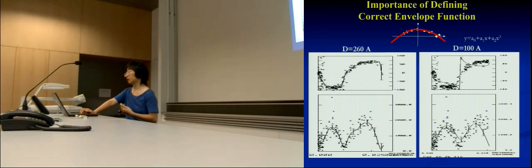So it's a way of finding out if you don't know your protein well enough to know how wide it is. You can start off with a guess of what you think it should be. A layer of a membrane protein is probably 100 angstrom or something, sometimes a little smaller. If it's just a single layer, there's no two-fold symmetry in there.